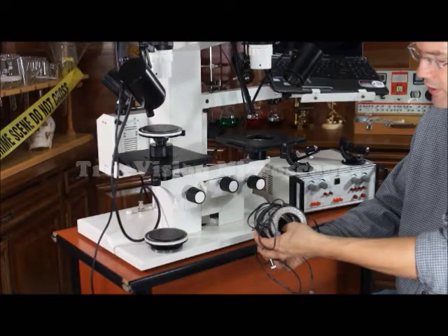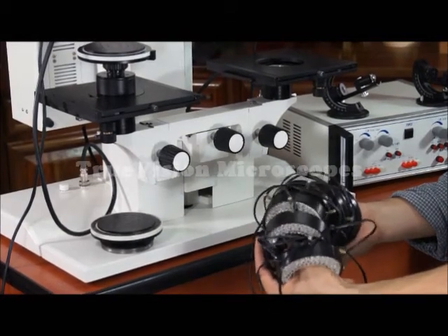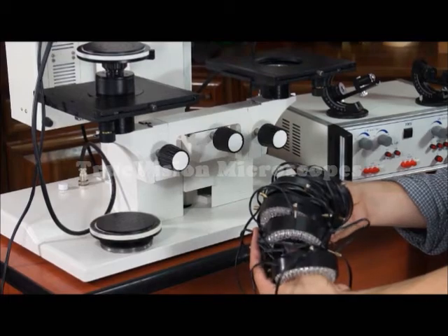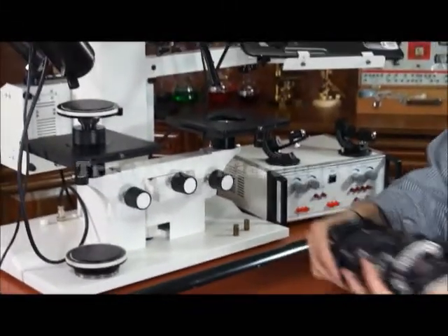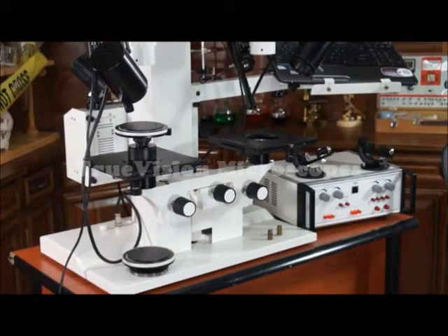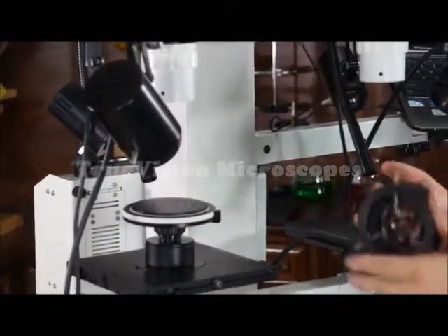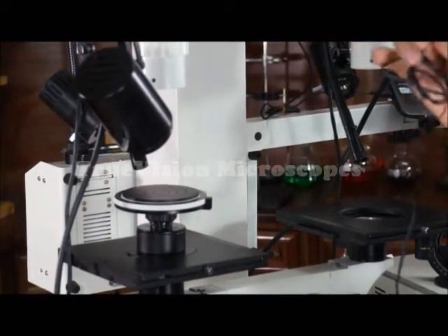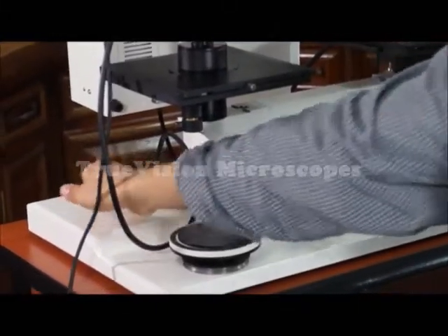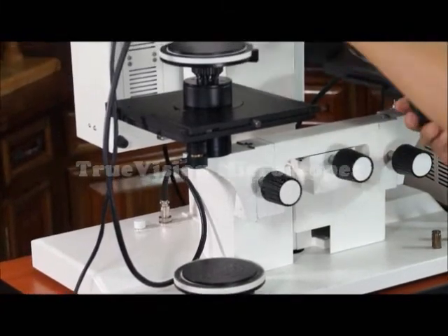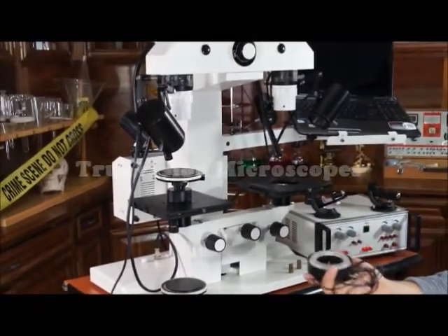These are ring lights. They're LED ring lights. I have one pair that is a UV ultraviolet. I have another pair that is an infrared, and I have another pair that is a white light. These ring lights simply mount underneath the objectives. And they have a plug in that has a port on the sides. That's the ring lights, UV infrared and white light.